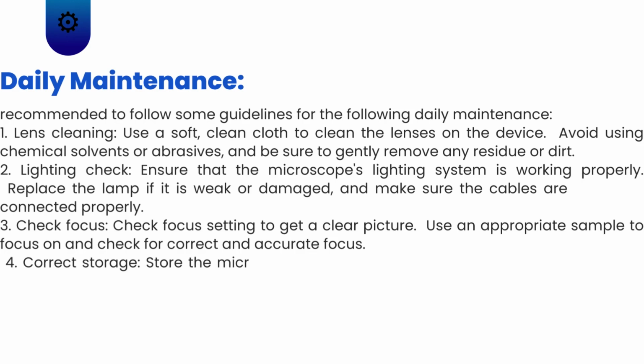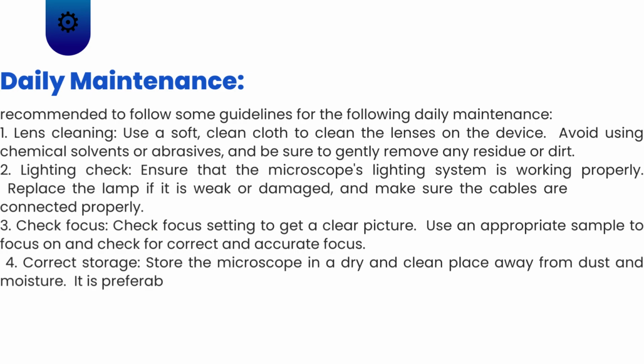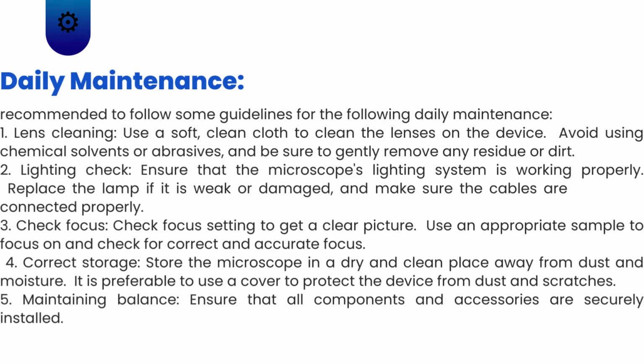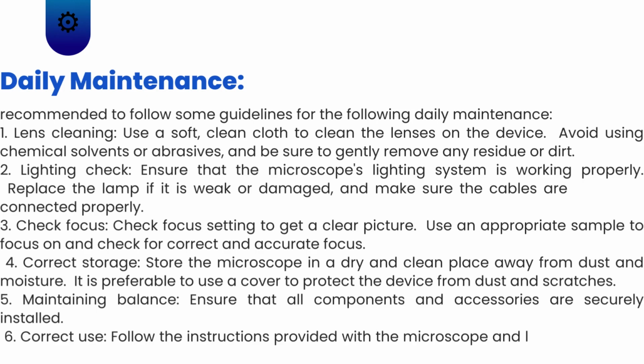4. Correct storage. Store the microscope in a dry and clean place away from dust and moisture. It is preferable to use a cover to protect the device from dust and scratches. 5. Maintaining balance. Ensure that all components and accessories are securely installed. 6. Correct use. Follow the instructions provided with the microscope and learn how to use it correctly.